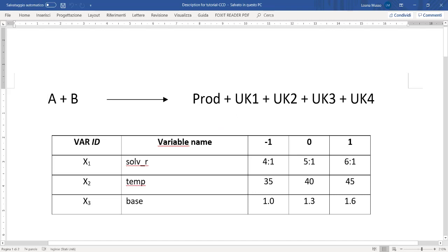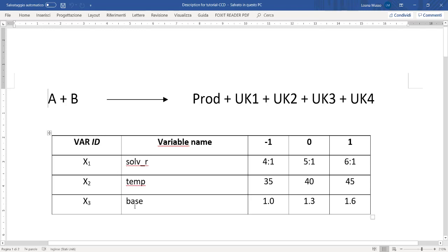This is a chemical transformation, a chemical reaction from two components A and B to give the desired product and four different unknown impurities. We selected three variables: solvent, temperature, and base.